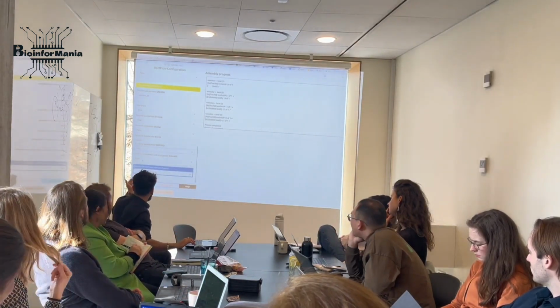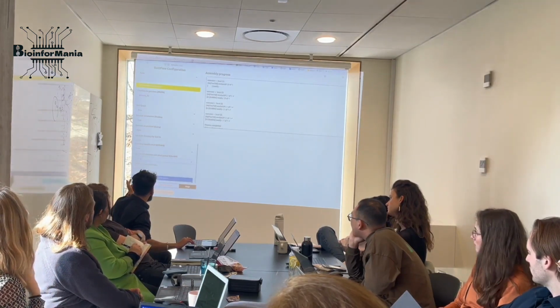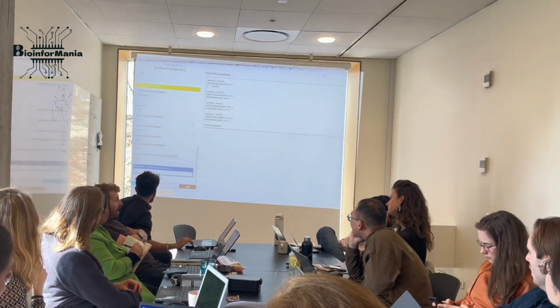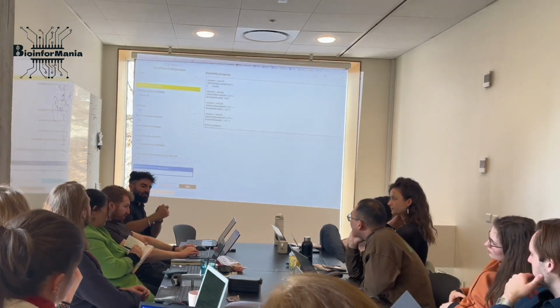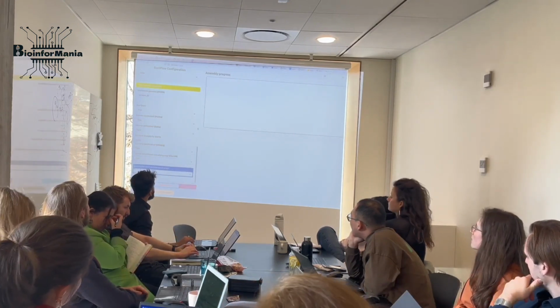Okay, and then genome completeness check. If true, again, you need to have its database. Heavy, time-consuming. No, thank you. And then set this to true if you want to. If sometimes the assembly fails and you did some changes and you want to resume from the previous part, always set this to true. And then we run it right now.